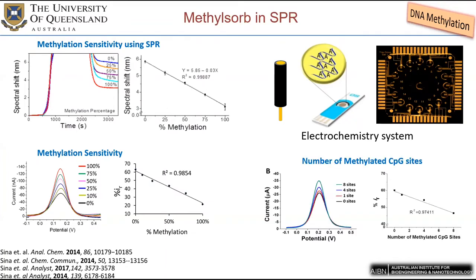And also we have seen that we can actually detect single CpG sites in a synthetic DNA system. So we published these works in different journals. You can have a look if you would like to get more information on these methods and how they work.